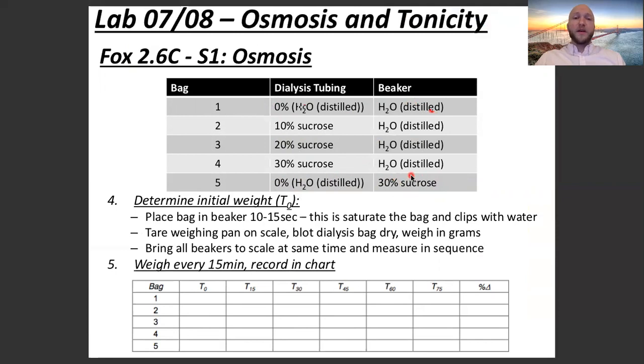So this lab is entitled Osmosis. What do you think is going to happen? You should know a few things about osmosis based on the lecture by this point. All right, so we're going to measure the weights of the bags at time 0 using a scale, and then every 15 minutes, we're going to pull the bags out of the solution, measure their weights for about an hour and 15, hour and 30 minutes. What do you think is going to happen?